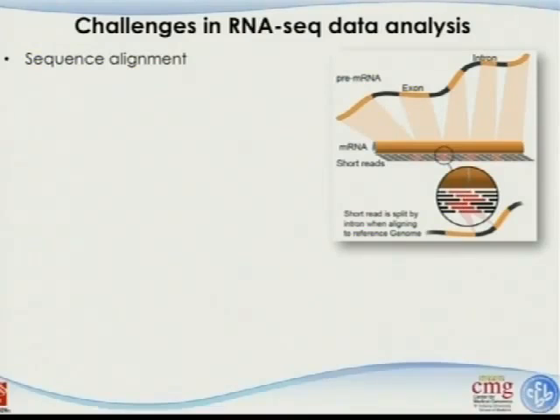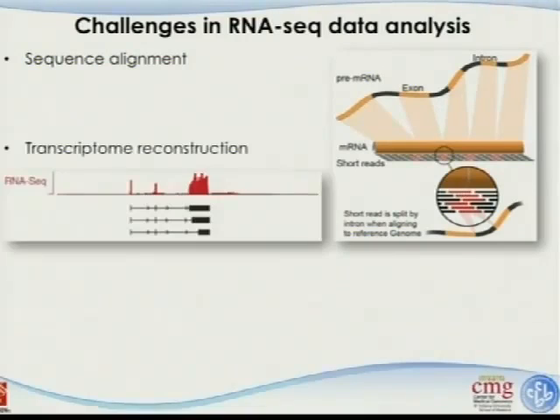At a single breakpoint here, there's one read that covers this region, and using the traditional alignment algorithm, we cannot map these reads back to the genome, because none of our aligners can handle big gaps, which for introns sometimes go to 10,000 base pairs. So there's no way we can find it. We need special strategies to fix this issue.